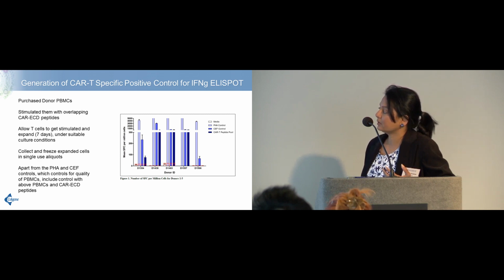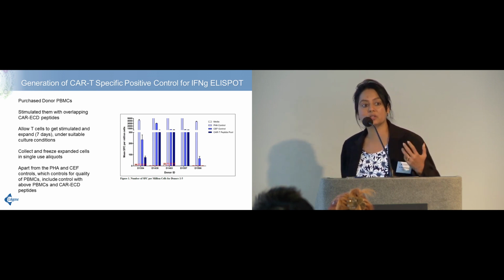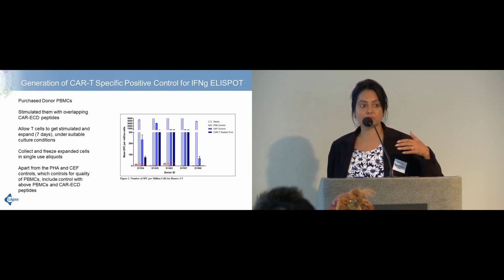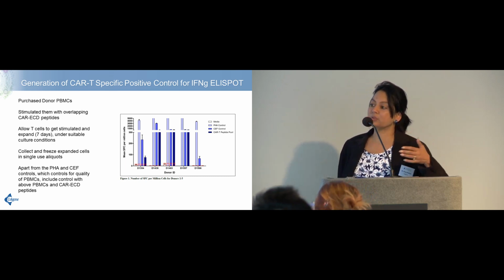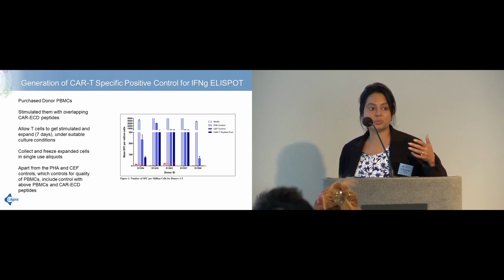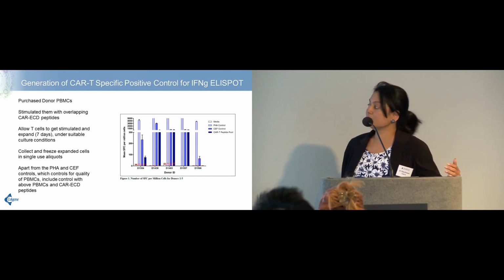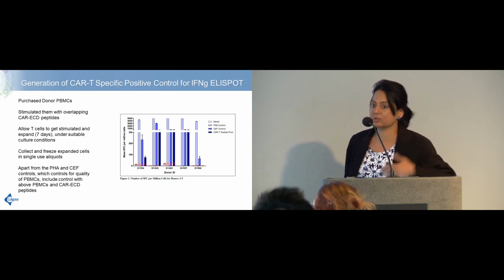And they are frozen down as single-use aliquots, I believe, so we can use them not only during our assay validation to validate with our own pool, but also during study sample analysis as a positive control on every run when we are running study samples, because we hope to use this over multiple years. And maybe we have to synthesize multiple peptide pools to have enough.